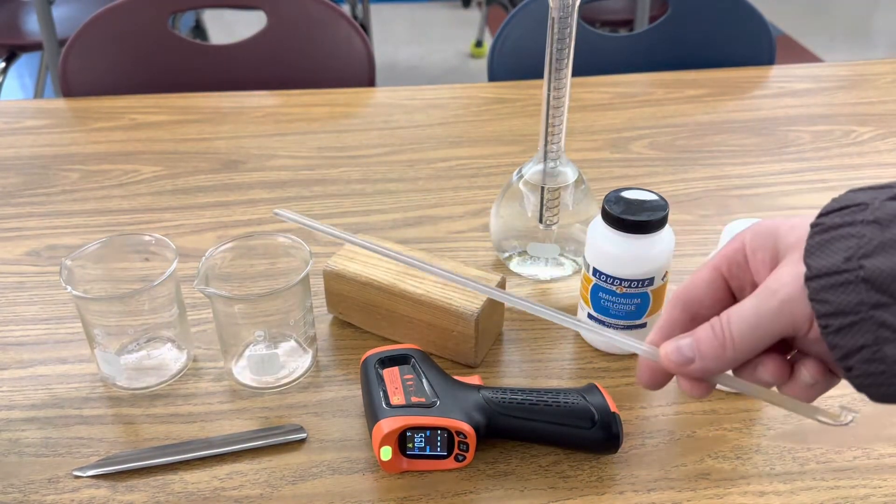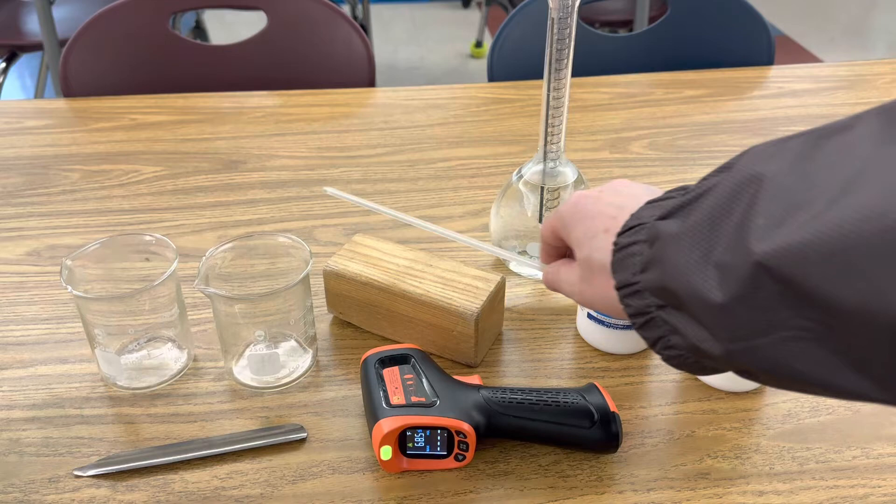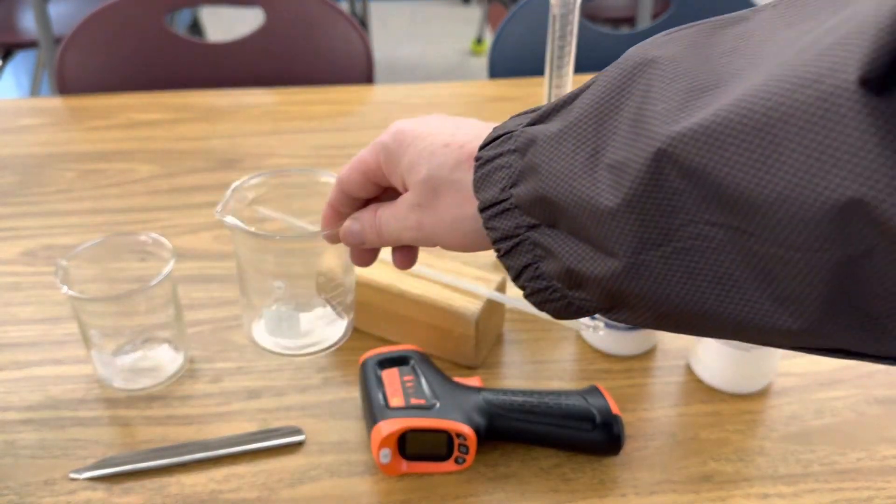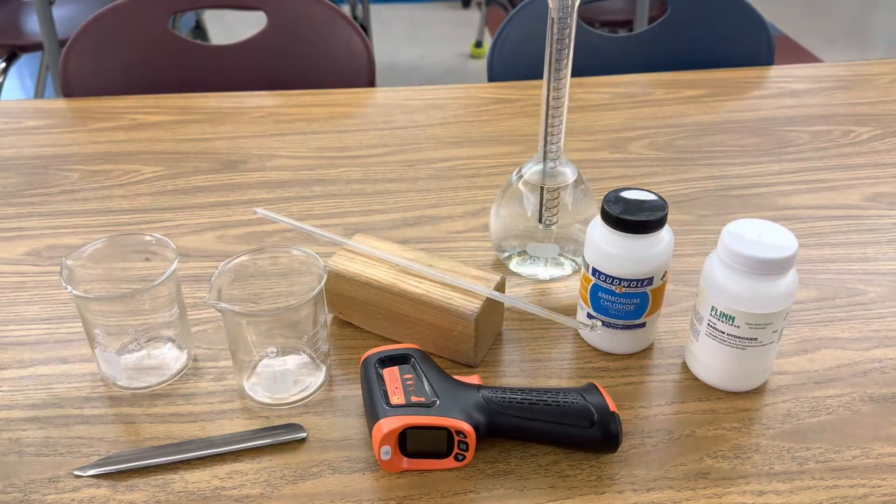I'm also using a glass stir stick, a block of wood, and two 250 milliliter beakers in this investigation.